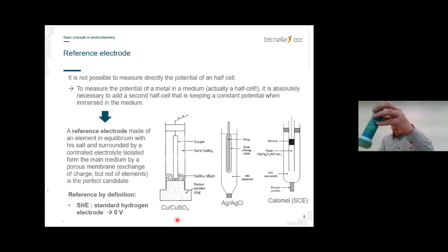In addition, we tend to use electrodes that have a potential, compared to the hydrogen electrode, that is close to the system we want to measure. And the copper sulfate electrode is quite convenient for field measurements. Then I have here another kind of electrode.